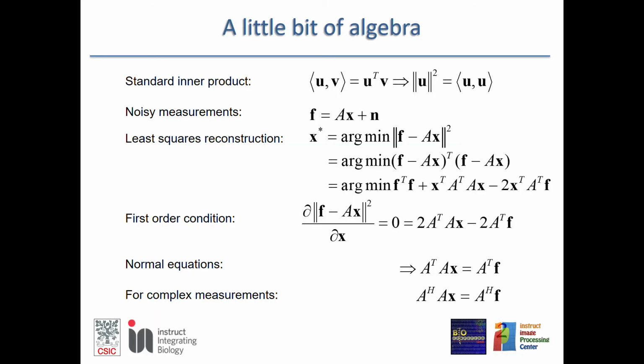Okay, so this is the other family that I mentioned before. This is an algebraic interpretation of the 3D reconstruction problem, and again we will not enter now into the details. But here, what we are formulating is the image formation model. So the image formation model says you have some measurements.